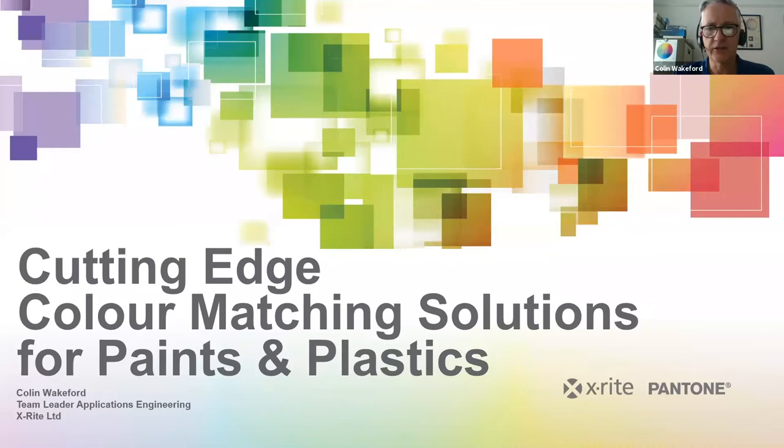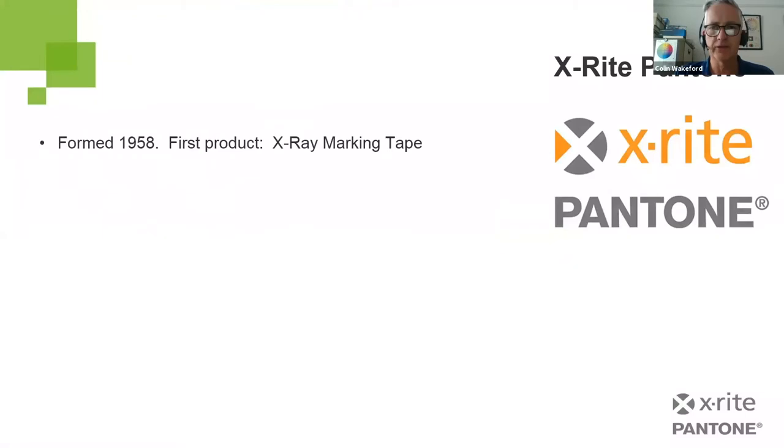So cutting edge color matching. I'm going to break this into two sections, really. The first half to talk about software, and the second half to talk about spectrophotometers, or the instrument side of things. So to start off, just a quick couple of slides on who X-Rite are, for any of the audience who might not know.